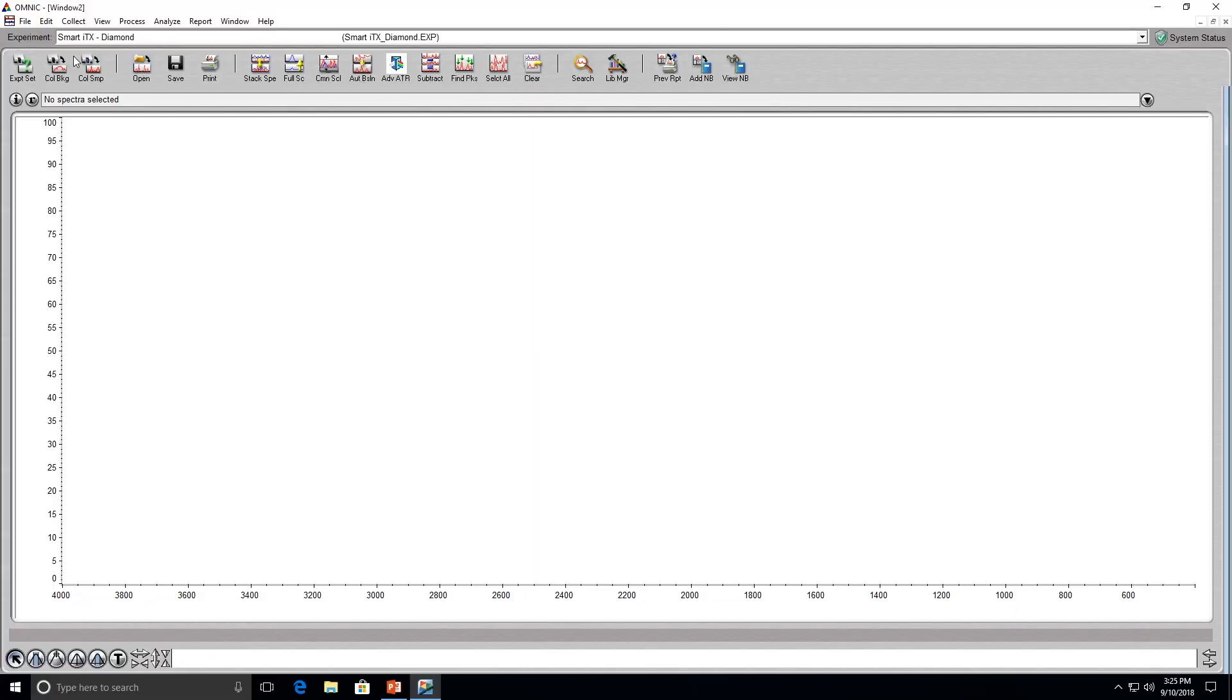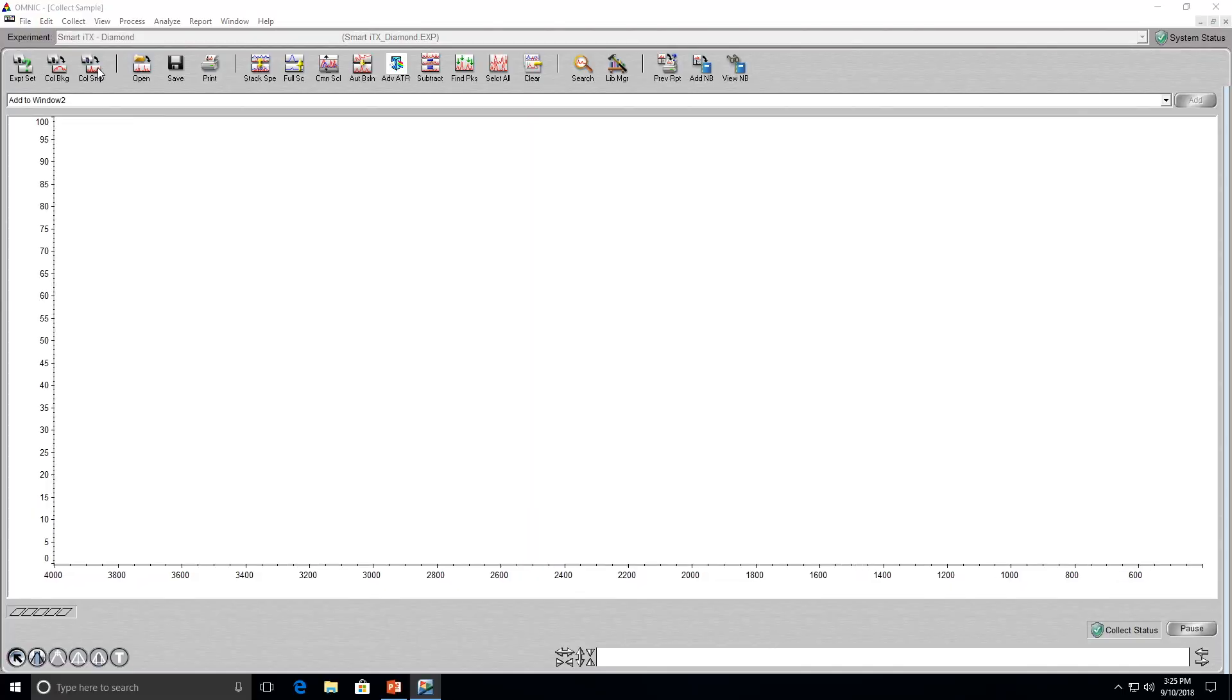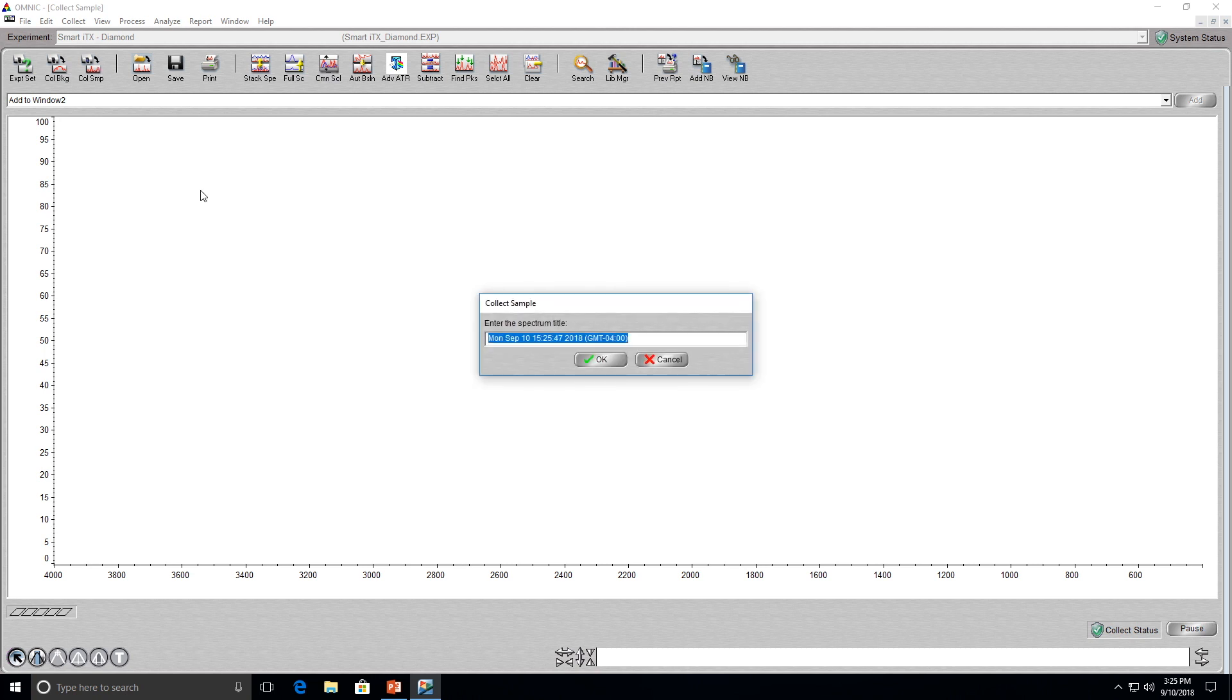Once your sample is all set on the crystal, you will click the collect sample button. A box will pop up and ask you to enter the spectrum title for your sample. An example spectrum title would include your name, the compound being analyzed, the course title, and the day and time of the lab.